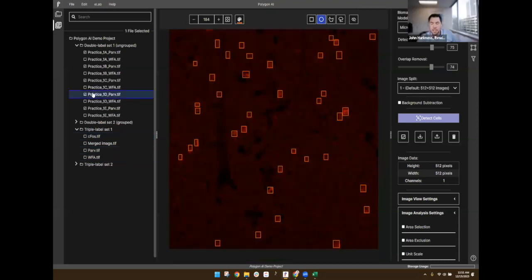Yeah, that's a great question. So we have a couple really powerful tools here that might help you start to get to that. The first is just a really simple lasso tool. Up there on the top, this allows you to select a whole number of things all at once. I think this is a little bit the opposite of what you're looking for, but that's giving me a thought that we might be able to provide an invert feature for that.